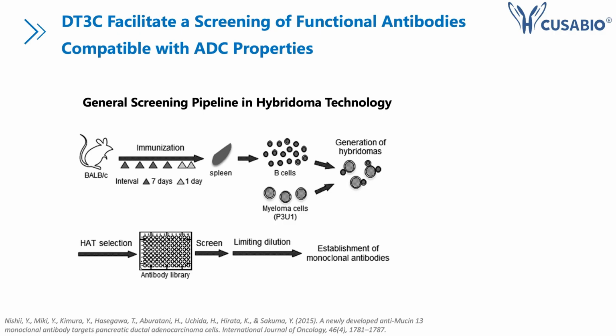DT3C can also be used in combination with the hybridoma technology to facilitate the screening process for good. You can spend more time in the screening stage and then save some more time in the later stages.